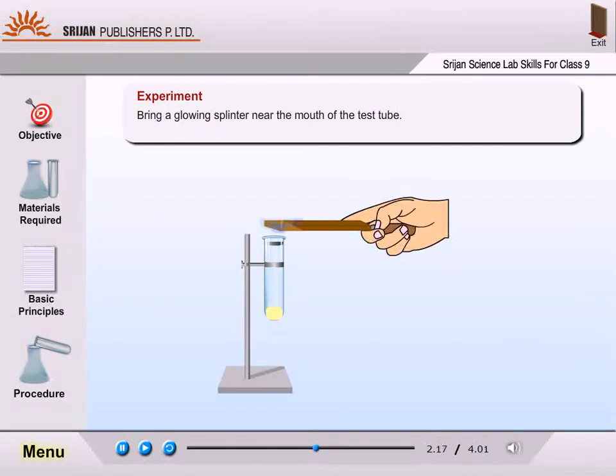Bring a glowing splinter near the mouth of the test tube. Glowing splinter bursts into flame. The evolved gases contain oxygen gas.